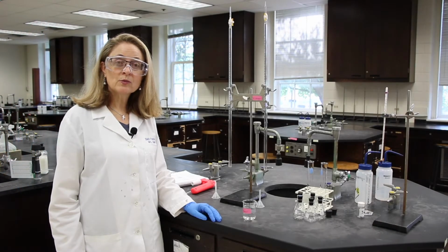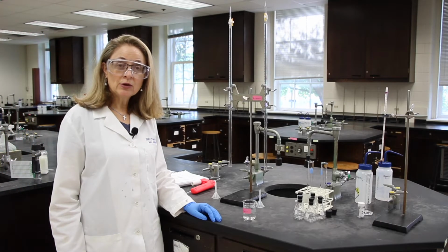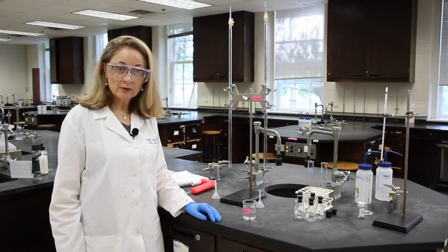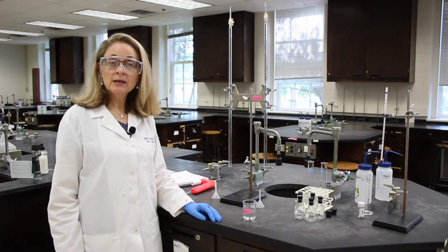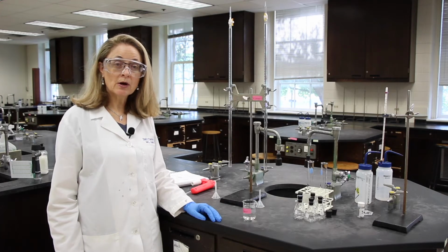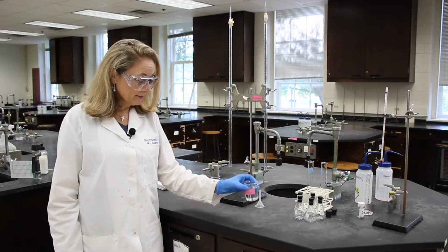We're going to start in with the procedure. I'd like you to follow along in your lab manual. The first step says obtain about 80 milliliters of 2-propanol, and I've already done that.